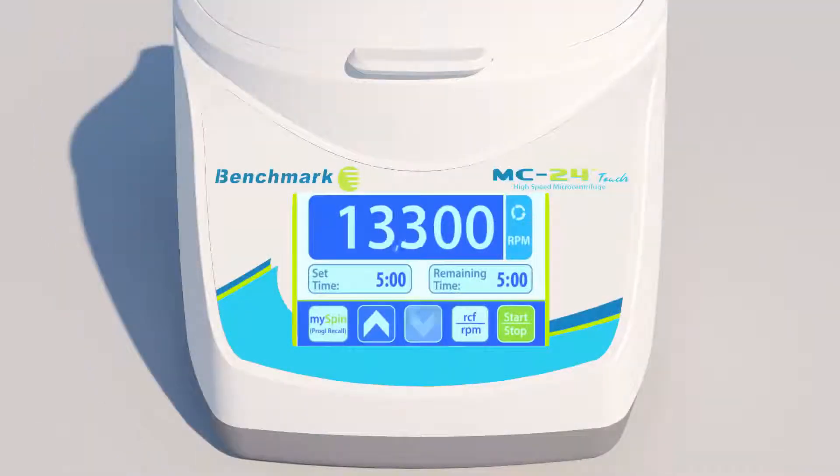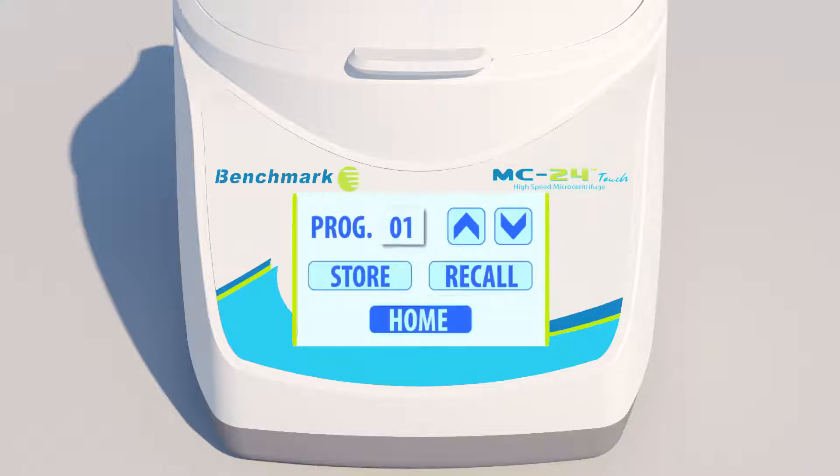Recalling your favorite settings is as easy as pressing the MySpin Program Recall button. To use it, enter your favorite settings, then hold the MySpin button for 3 seconds. When the Program Storage menu appears, press the Store button to store your settings in the first slot, then press Home to exit.